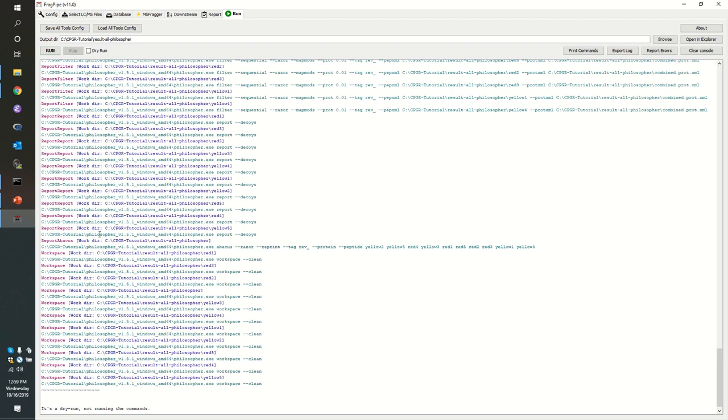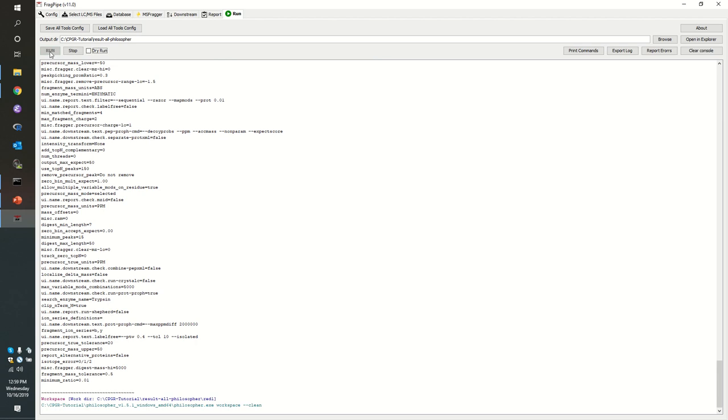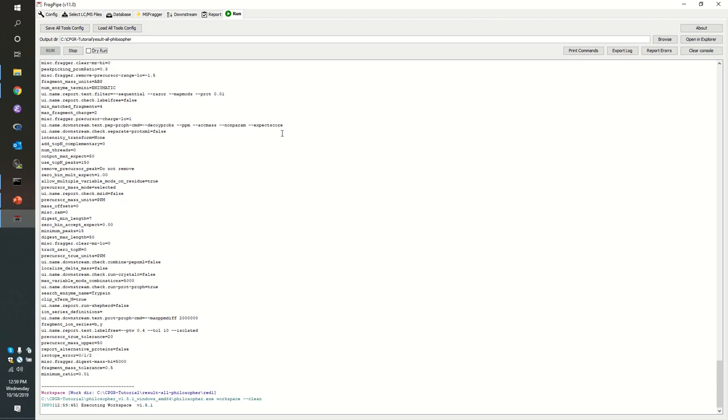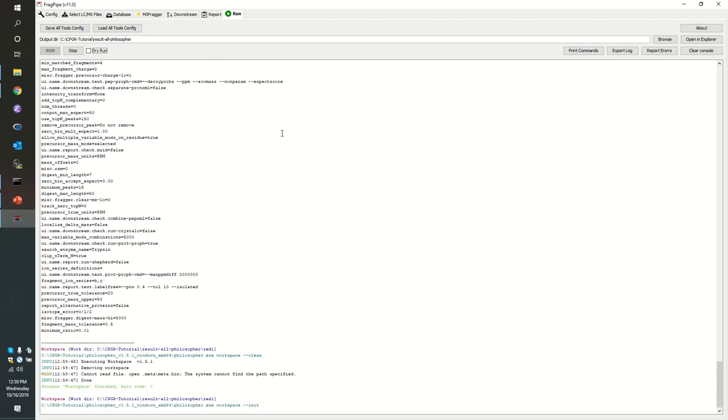Report Abacus is going to work from this top-down appraisal of all the proteins that have been seen to say how many spectra were identified to each protein in this raw file. So we see it's quite a lot of stuff to do. So I'm going to go ahead and click run.